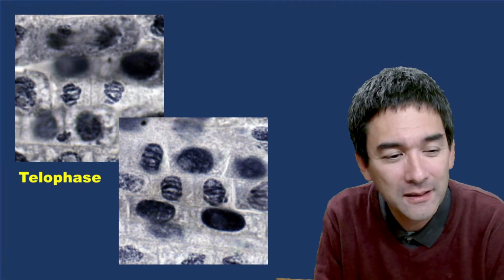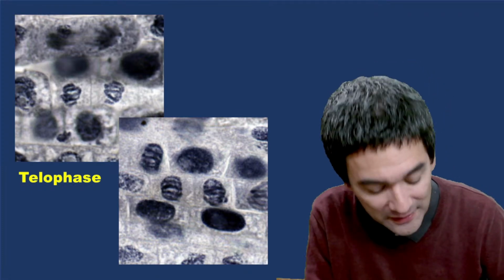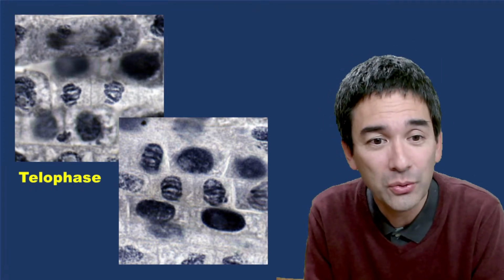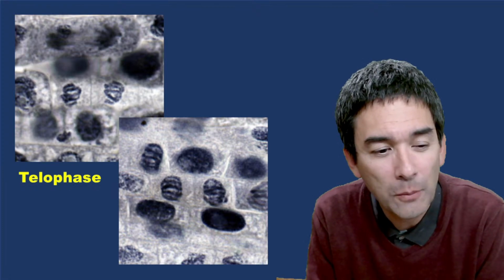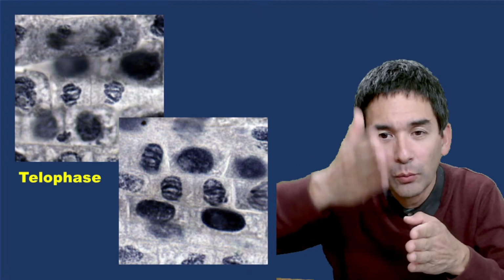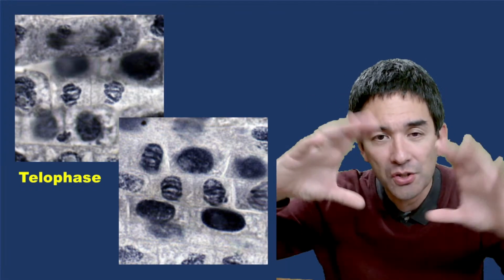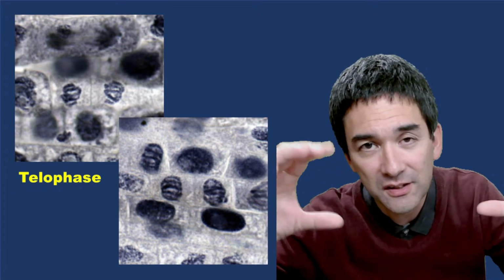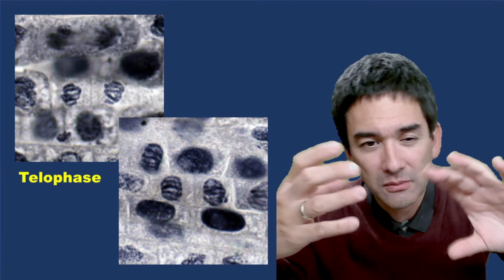And if you now think that everything like this is a little bit static, I'm going to show you an interesting comparison video, because what you see over here in telophase is that a new cell wall is forming between the cells, because the cell wall of onion cells is rigid, so it's not very flexible.